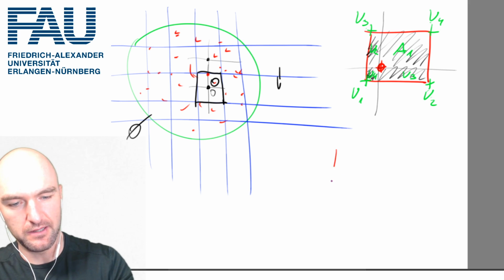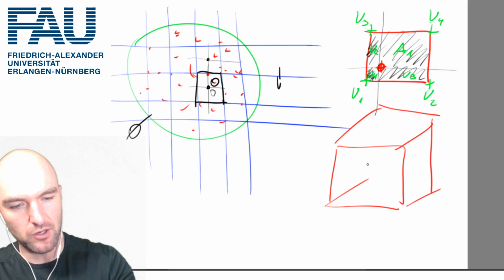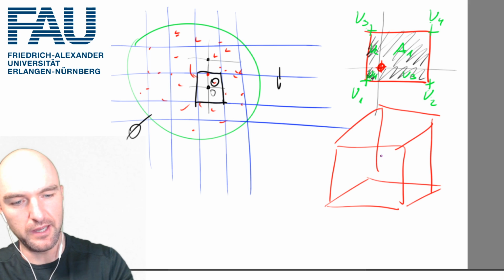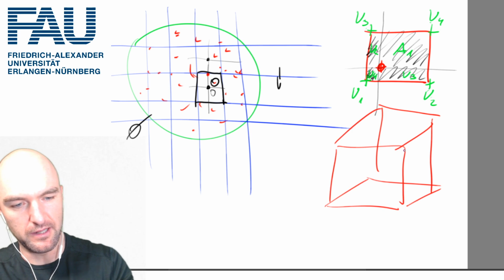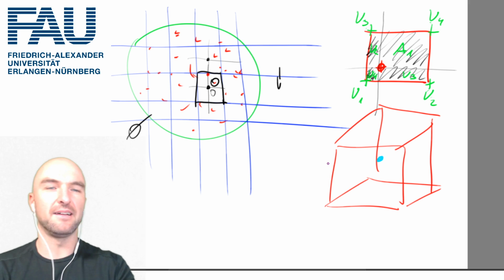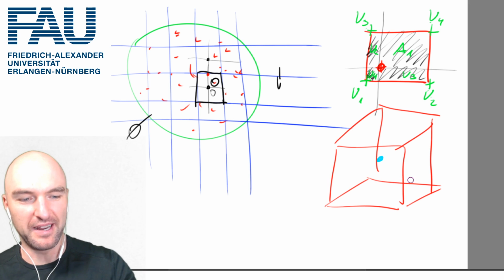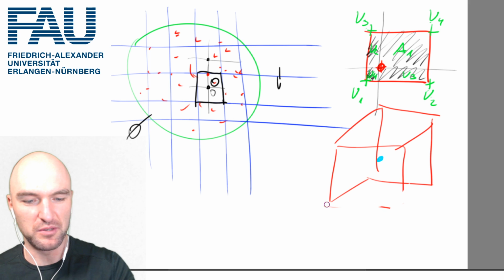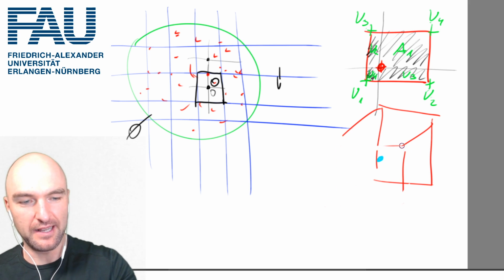And you can do the same thing. Let me just do a drawing. You can obviously do the same thing in 3D, so let's put our little thing somewhere here in 3D. And now, in 3D it just works with cubes. I think I'm just going to confuse you more if I draw it in 3D. It's a little bit hard to draw, but it's exactly the same thing.